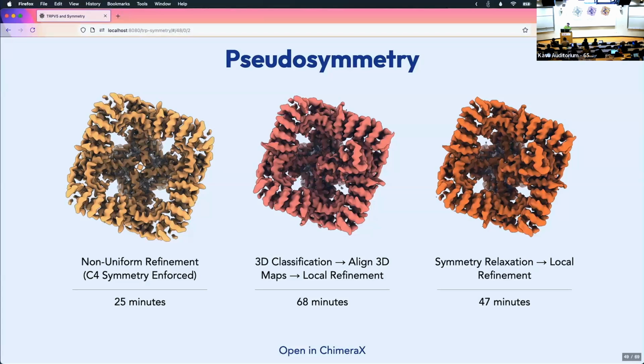The way it extends to symmetry relaxation is that our suggestions are pretty much the same as for whether you'd turn it on in any normal case. For small proteins, proteins with a lot of disorder, proteins with large micelles or nanodiscs, or when you're not confident in the signal to noise ratio and it's low, we typically observe that marginalization is a bit more stable. We suggest turning that on both as an alignment feature and for the symmetry relaxation mode. That being said, we've had reports on the forum that were contrary to that, so it's very hard to characterize in general. But you can always run two jobs in parallel and have them both going.